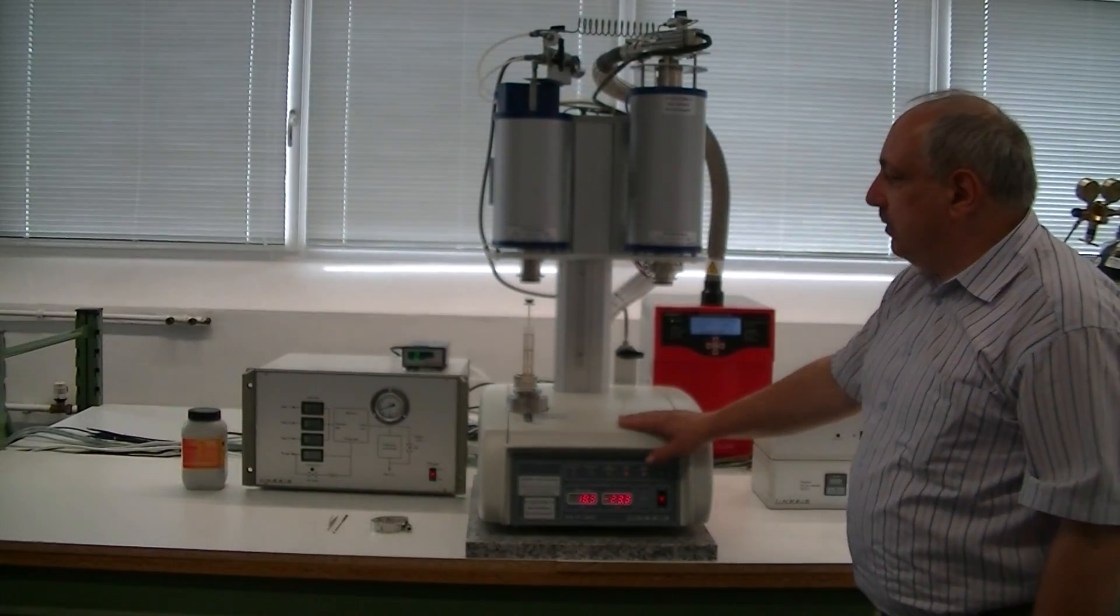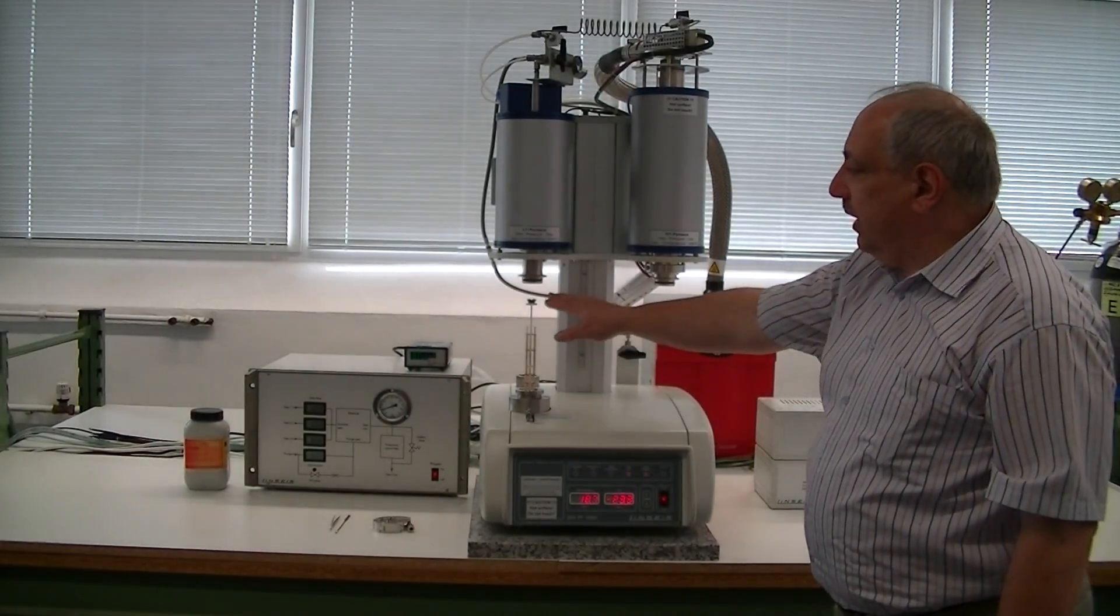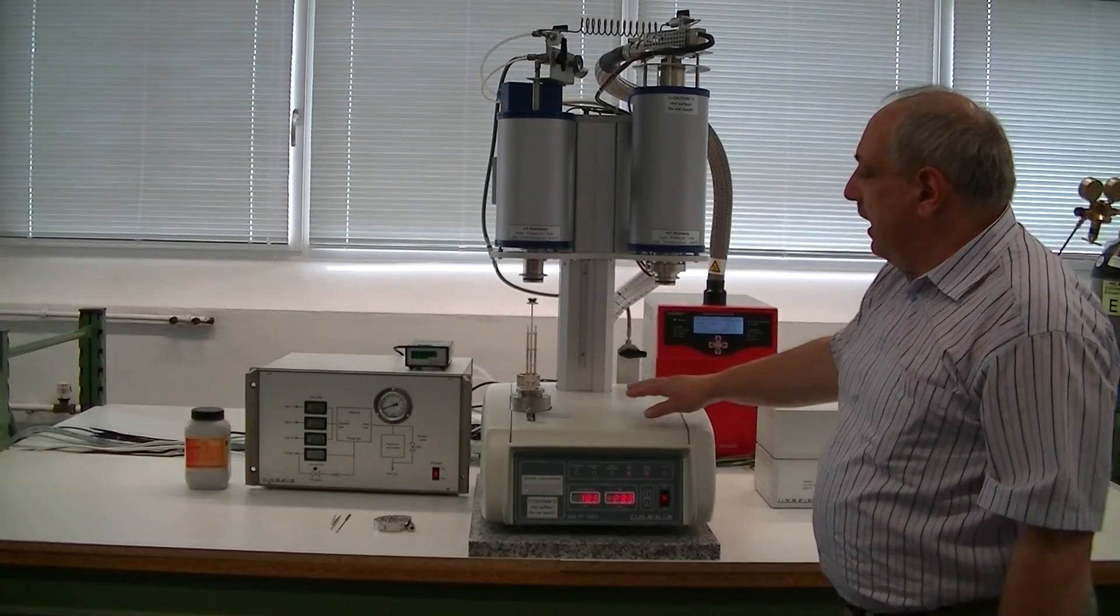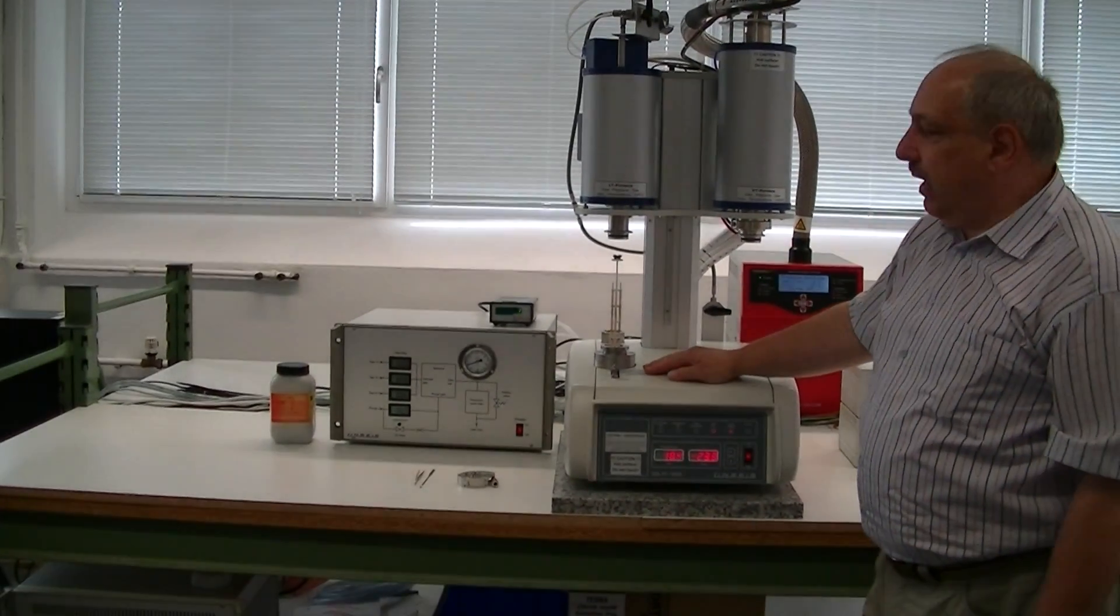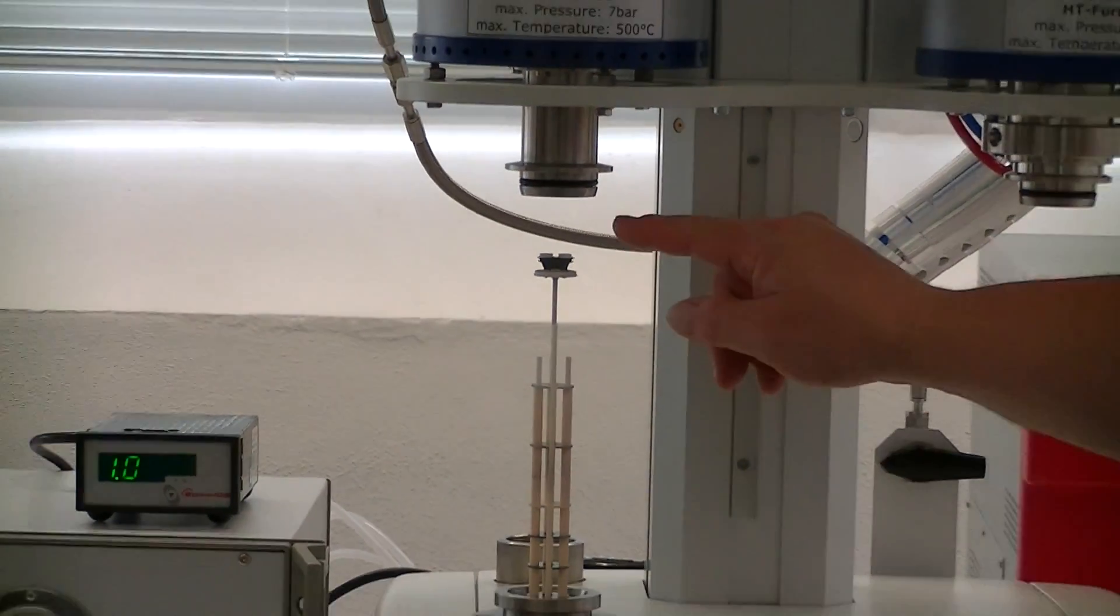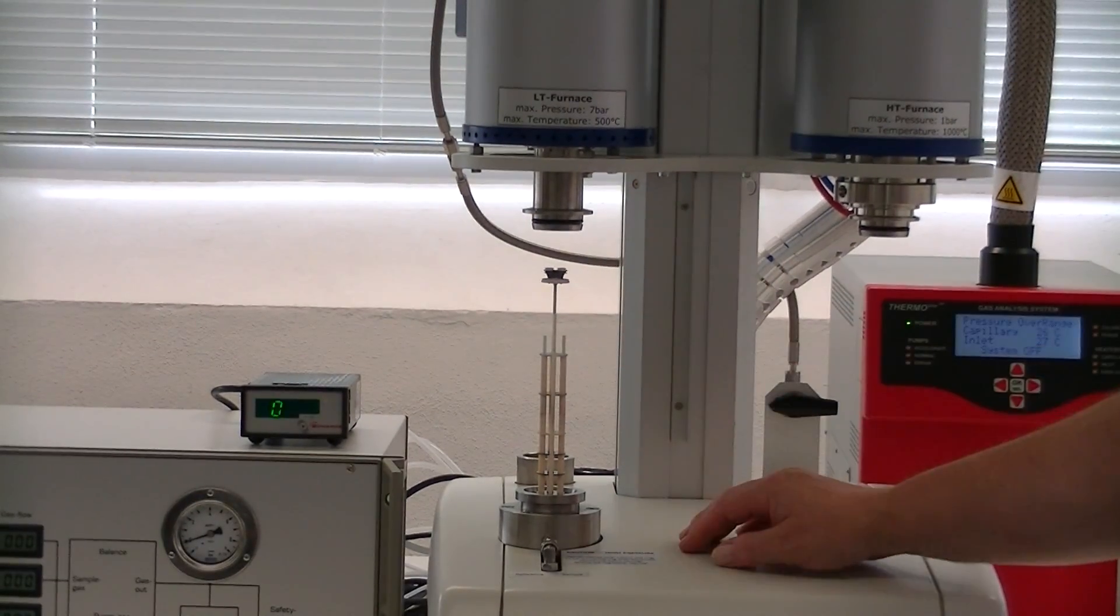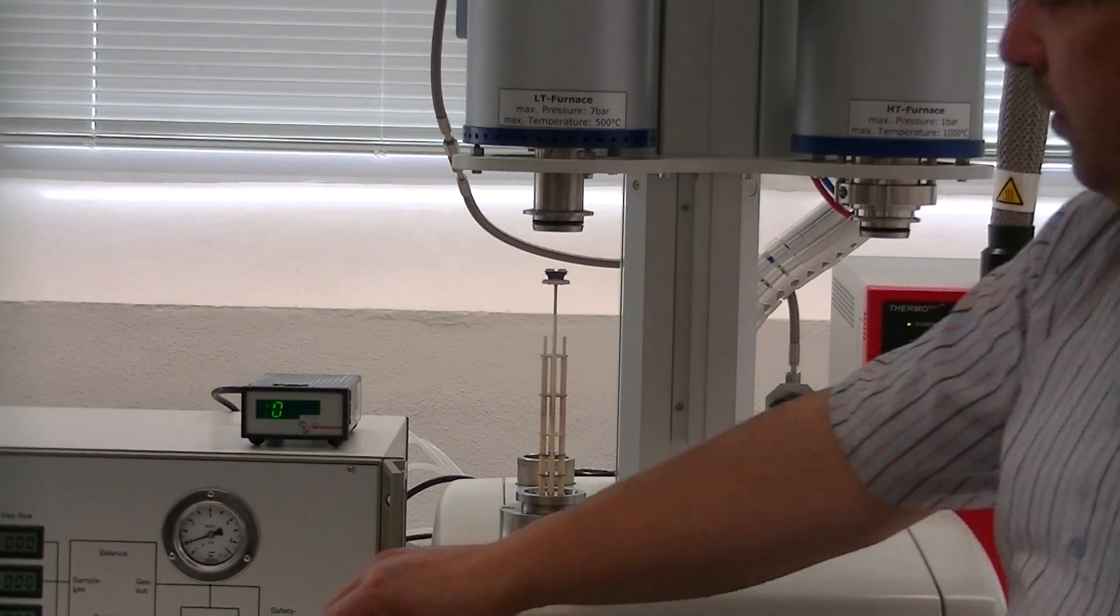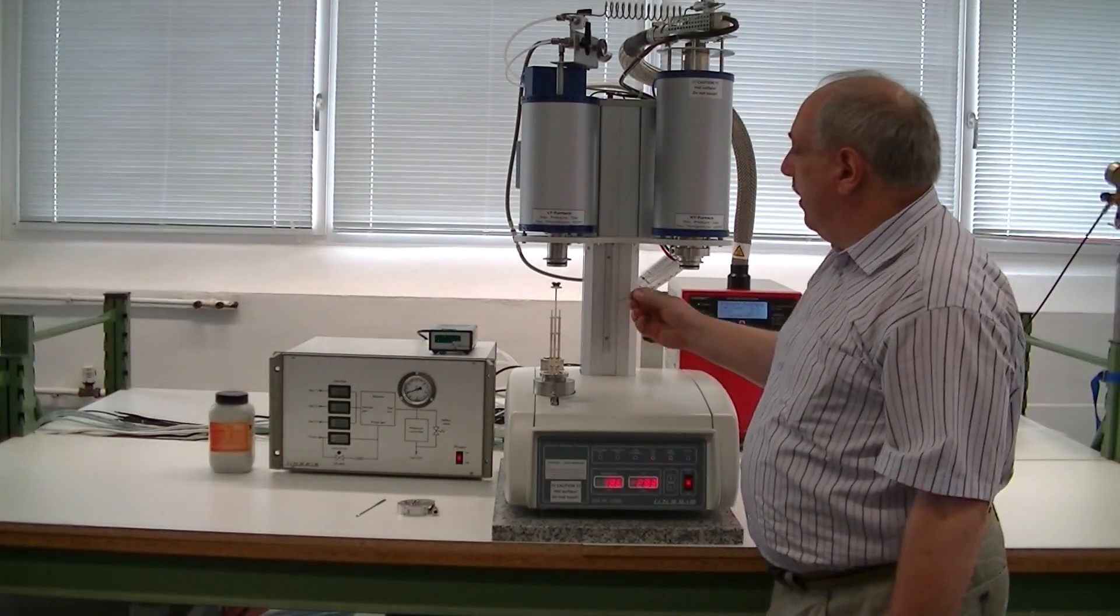To operate the system, you have to insert the sample here into the crucible. This is an STA system, you can measure simultaneously DTA and TG signal or DSC and TG signal. We have two little crucibles. And on the right crucible, you have to insert the sample.